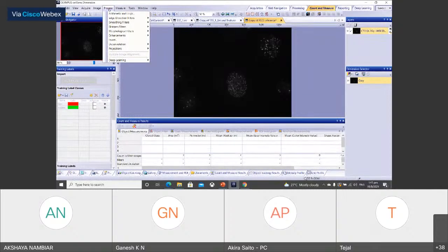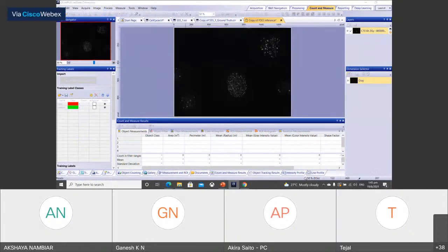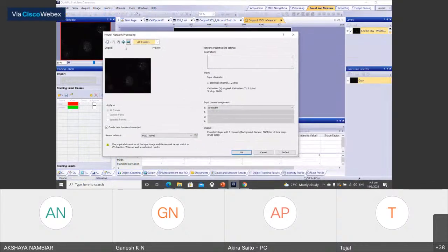Go to the processing and choose the neural network processing. Then you have this kind of box, and you need to choose which neural network you would like to use, and then click OK.